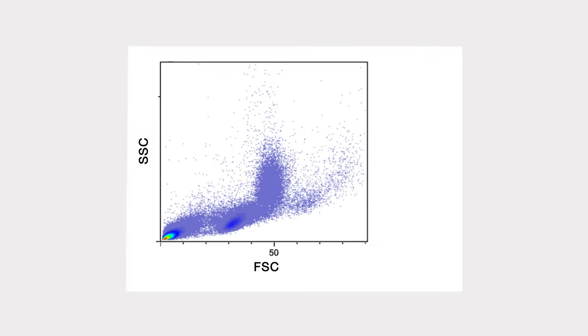Here's what the data actually looks like. Forward scatter is on the x-axis and is commonly abbreviated FSC, and side scatter is on the y-axis as SSC. Each dot on the plot represents data from an individual cell. So if we think about our sample of immune cells, we're looking at the entire cell population we fed into the machine. Even if you were someone who just passed by the machine without knowing what cells went into it, you could probably already tell that there are different clusters of cells in this graph. If we just look at the x-axis and draw a vertical line, all of the cells around this line have a similar size. But you'll also notice that the cells of the same size can still be very different because of their granularity.